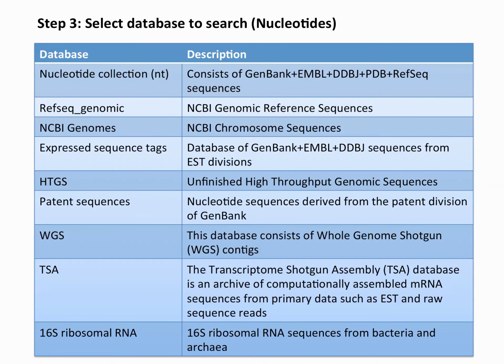Those databases for nucleotide sequences include GenBank sequences of nucleotides, genomic reference sequences, chromosome sequences, expressed sequence tag sequences, high throughput genomic sequences, patented sequences, contigs of genome shotgun sequences, and others.